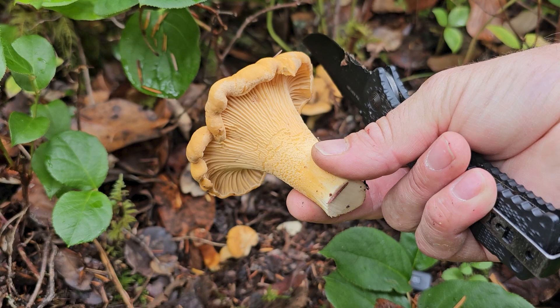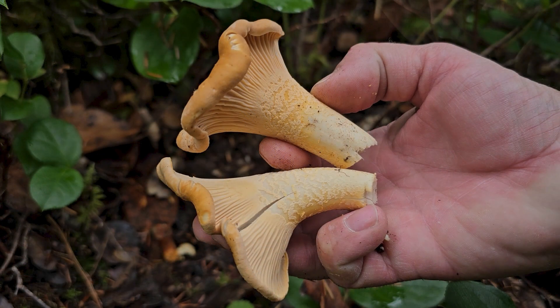So they don't have a huge long shelf life growing in the woods — they usually recede and dry up. You don't really see them in August or most of September. Then usually around the end of September or October the fall rains start, and a lot of chanterelles start growing, and they're much bigger, much more full of water, much more developed morphologically. So I was just curious if these little dry chanterelles in the summer are even producing spores.